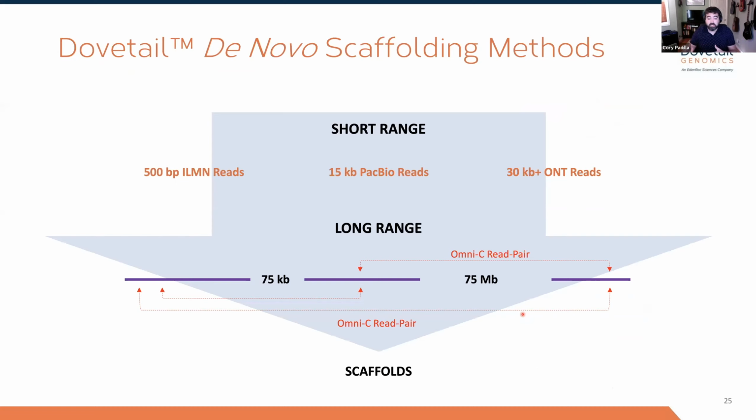We started as a genome assembly company really using that long-range information to piece together these scaffolds over megabases, right? And because the physical distance that our reads span is limited only by the length of the chromosome, we actually kind of consider PacBio and Oxford Nanopore as short-range reads. You're talking about kilobases. The Hi-C data type, you're speaking in terms of megabases, right? So that really allows you to piece together the contigs into these really nice long scaffolds that are almost the size of the chromosome.